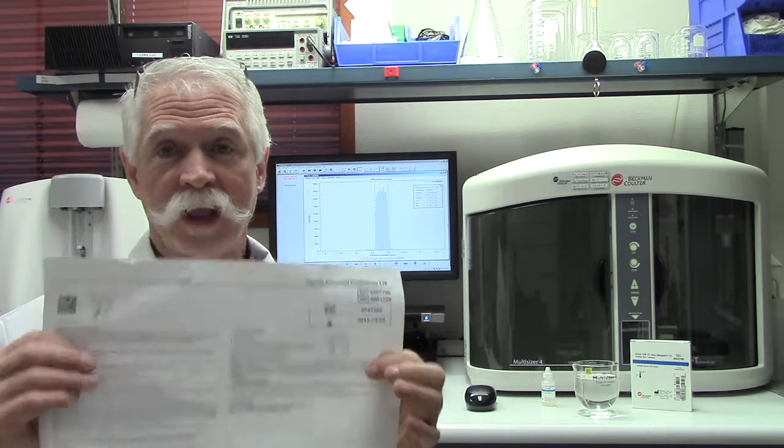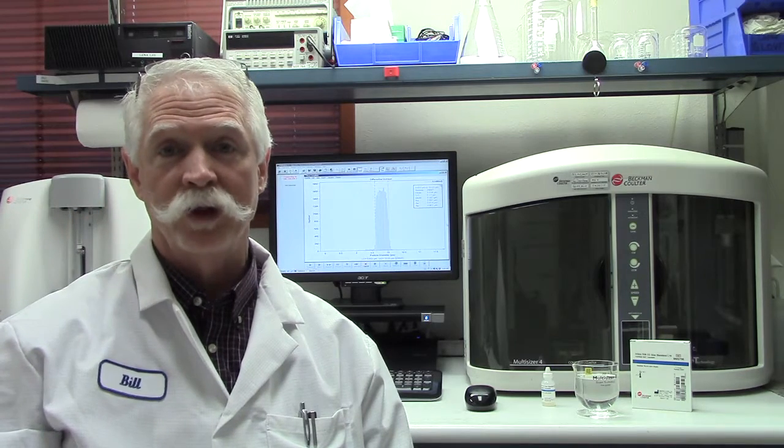When you open up the standards, you're going to find an assay sheet. The assay sheet contains three pieces of vital information. Number one: product description. Number two: calibration instructions. And number three: calibration data from which to compare your result to, to ensure the instrument is reading properly.